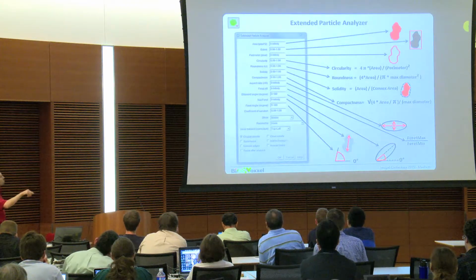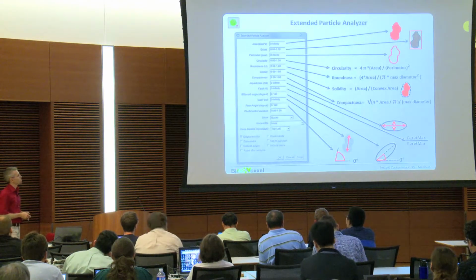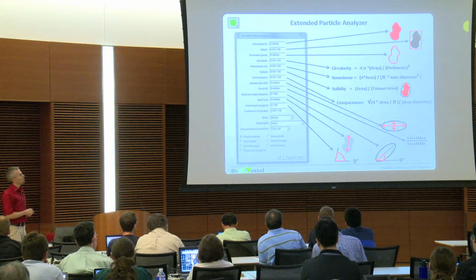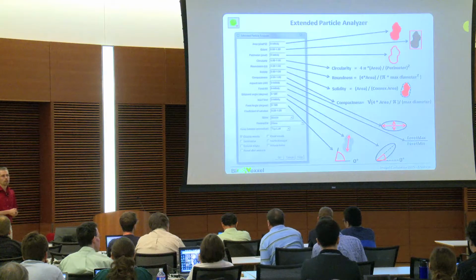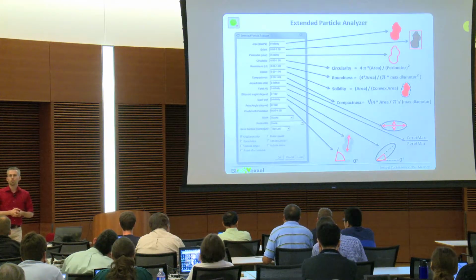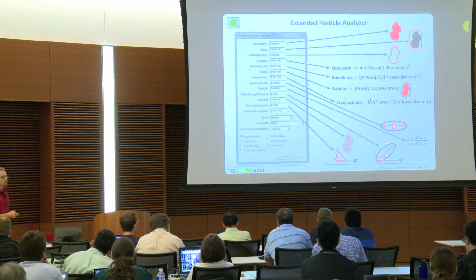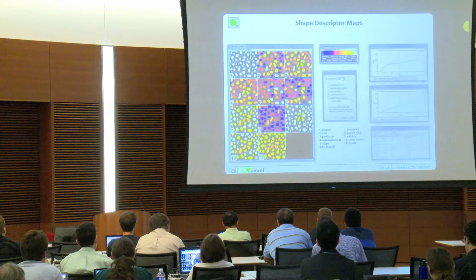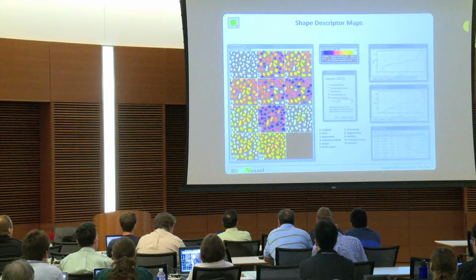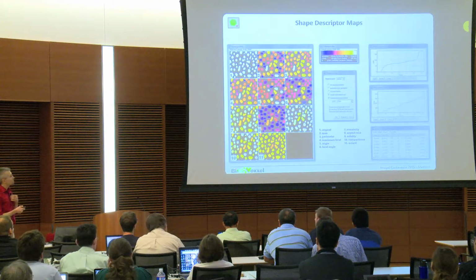So this image is also online on the Fiji homepage if you need to have a look at that to see which parameter to extract. The rest is actually exactly the same. The problem is now just how can I identify the parameter or the parameter combination which is helpful for me. And that, by trial and error, would take years here. So there is the possibility also in the toolbox that you can use the so-called shape descriptor maps. We'll directly do that on an example.